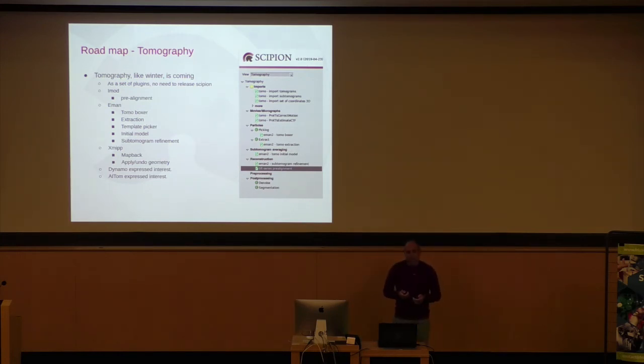And I learned recently that IMOD, I haven't tested the software, but they already had this intention of integrating it into Scipion. So our idea is to provide a set of tools for tomography, the same as we already do for SPA. Yeah? With the same philosophy: no coding, just integration. This screenshot is actually what I have on my laptop with many of those methods.